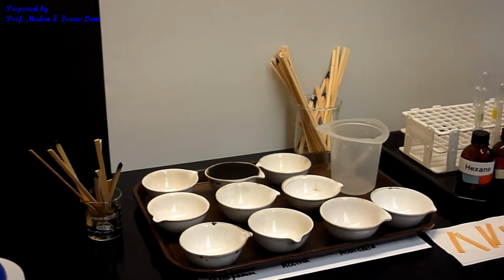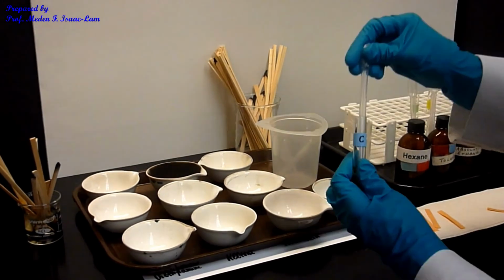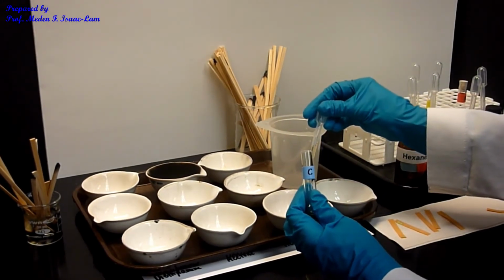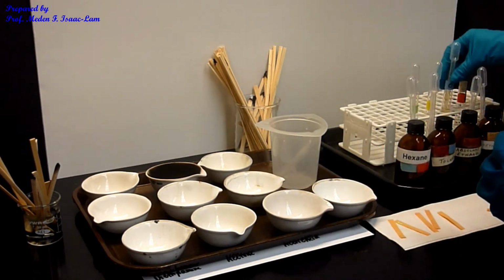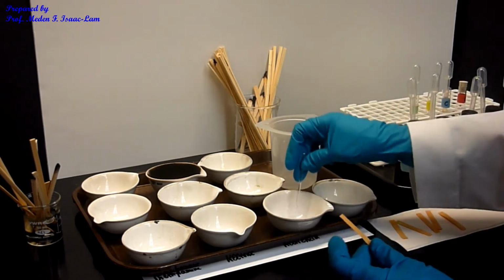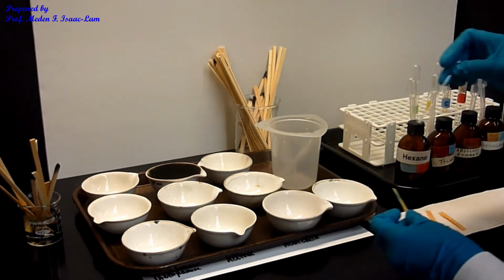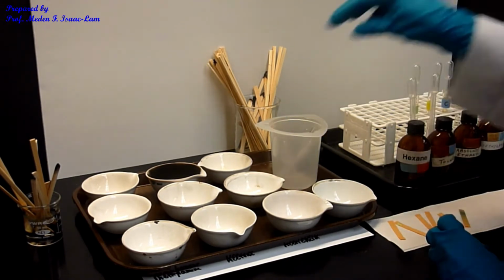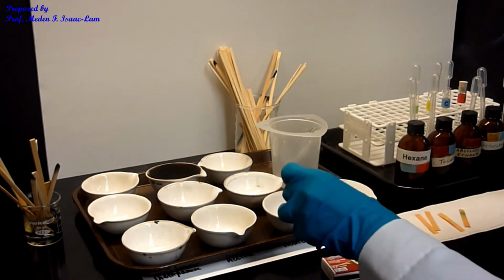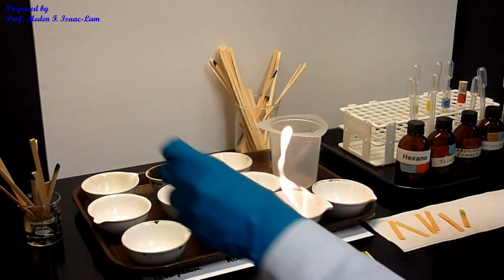Right, so now we're doing C, so unknown C. Okay, we're gonna do acidity, so acidity. Okay, turn color. Right, and now flammability. It's flammable.